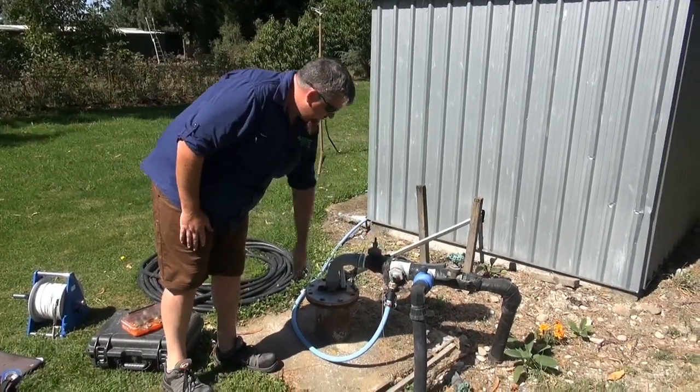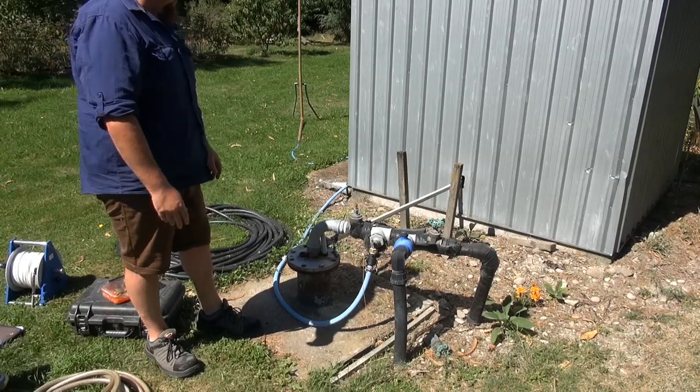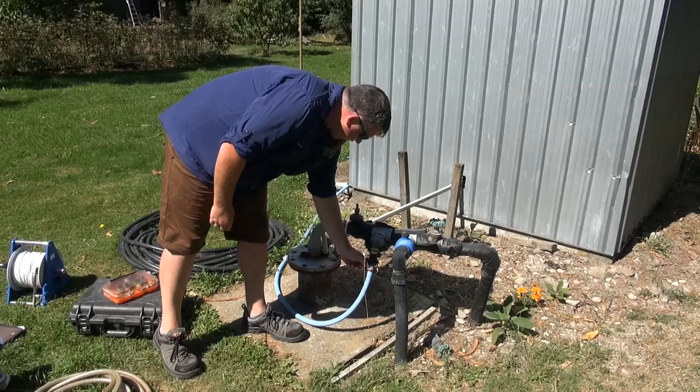For me the sample point is here, so I just disconnect that line. Just make sure the pump isn't running before you start disconnecting things, and there you go — connect up.